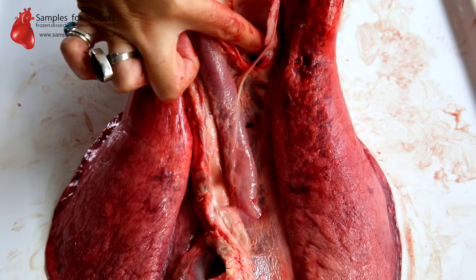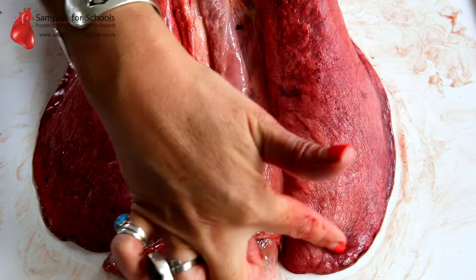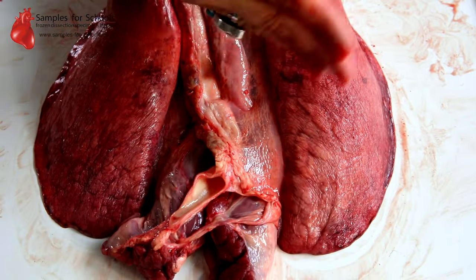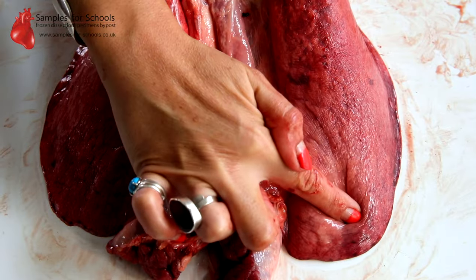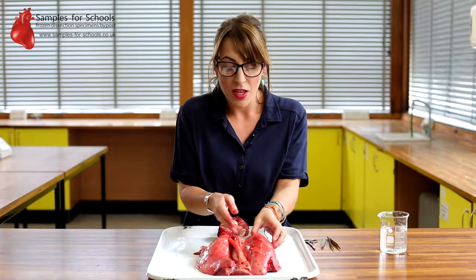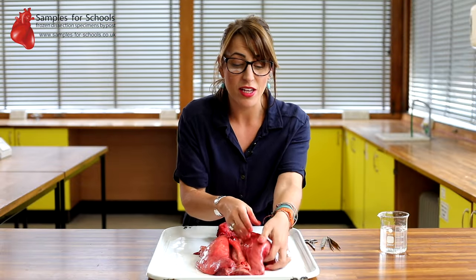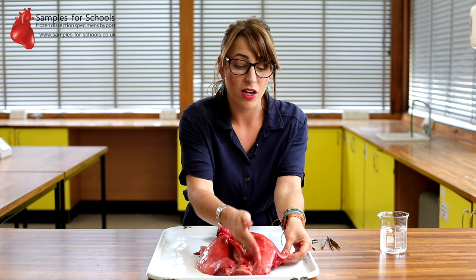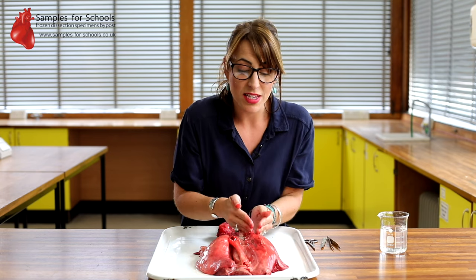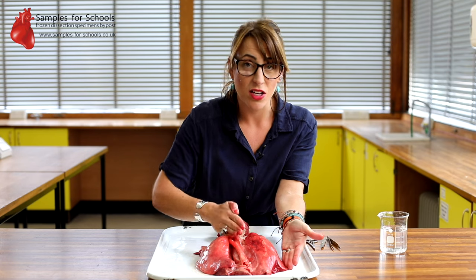If we follow the trachea down into the animal, we can see that when we get to this soft, spongy lung tissue, it branches. And it branches like a tree into two bronchi, one into each lobe of the lung. Those bronchi then continue branching out, just like a tree, into the whole rest of the lobe of the lung, right down into the very lower areas. It means that the air that comes down the trachea can get right down into all of this large surface area.